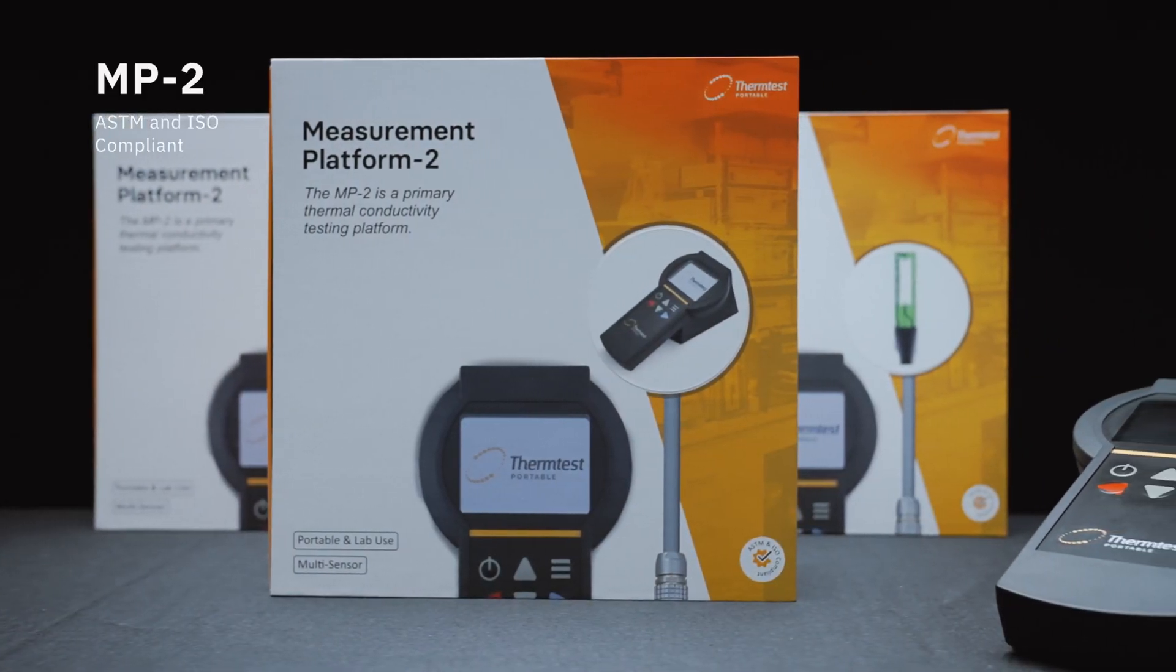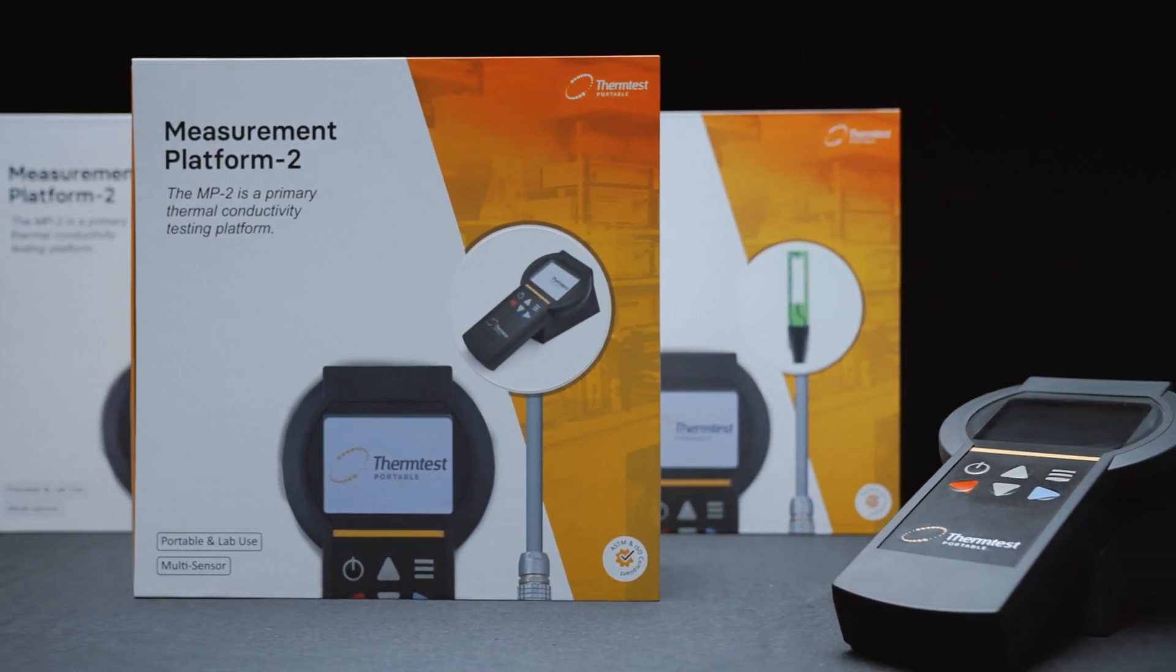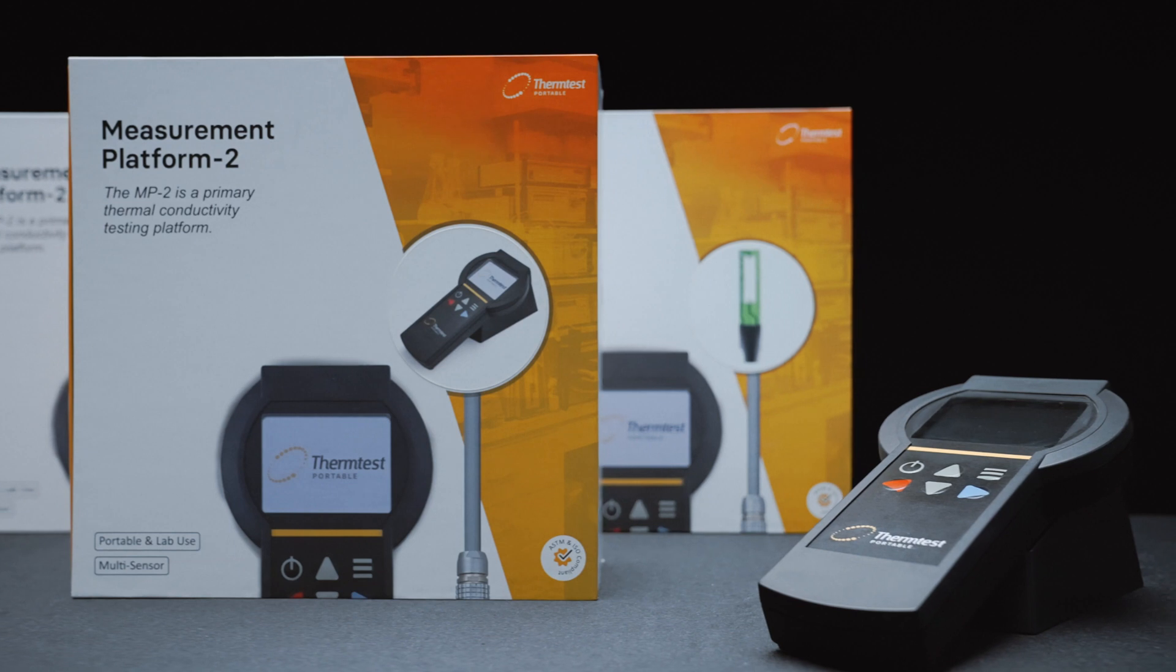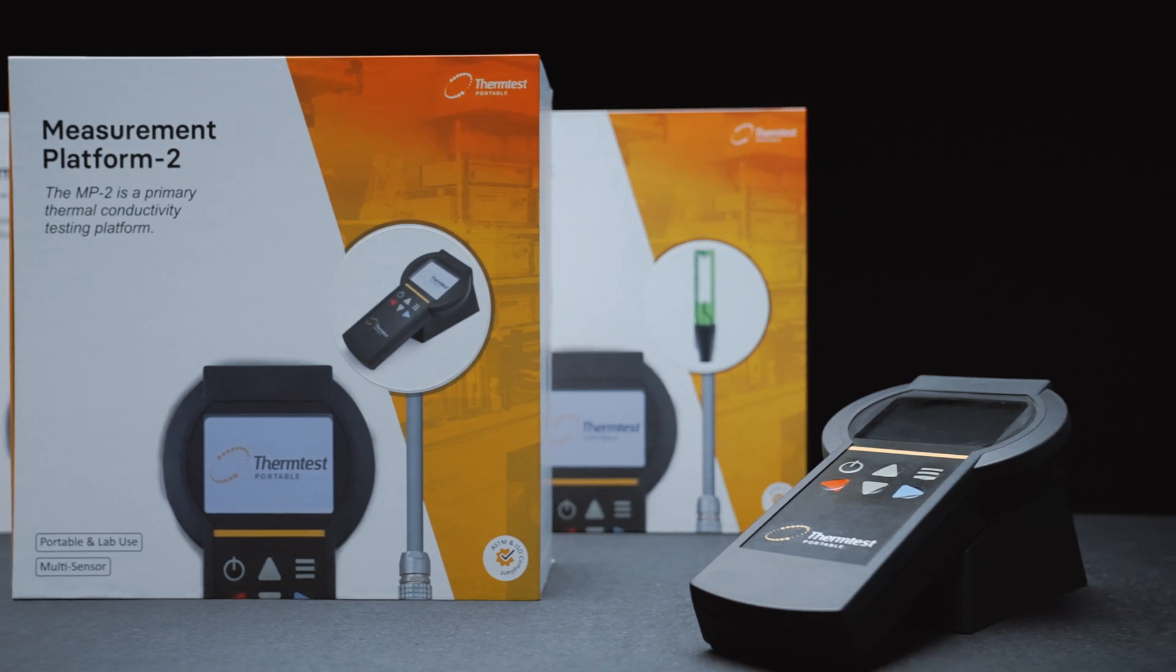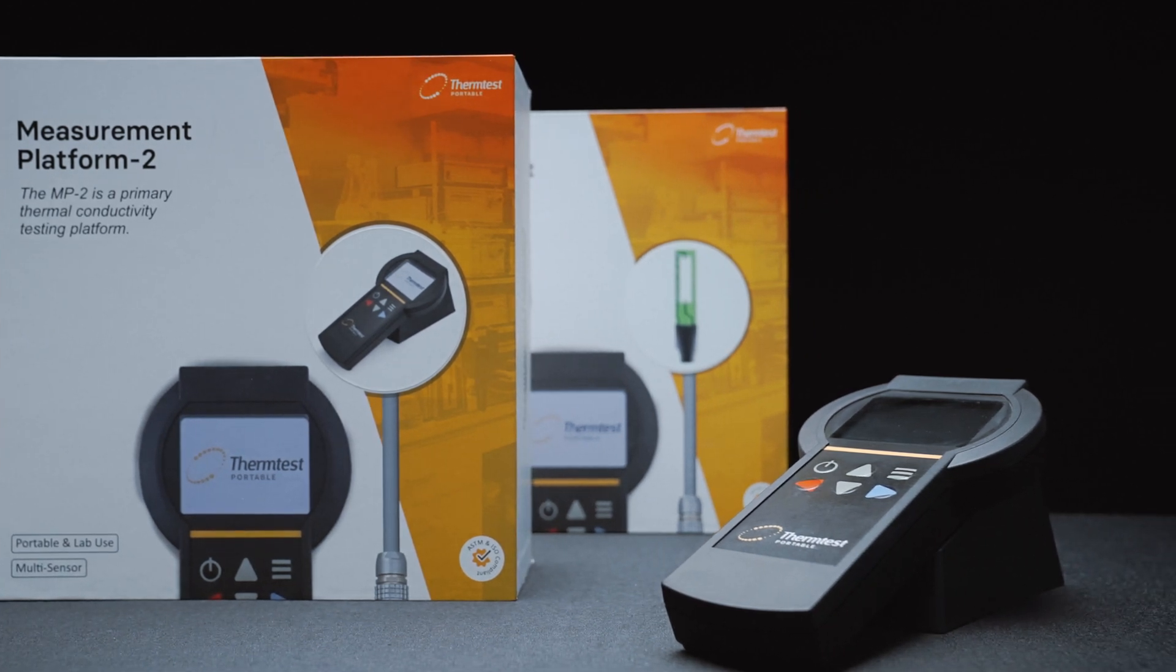Introducing the MP2 for thermal conductivity measurements of liquids, solids, pastes, and powders in accordance with ASTM and ISO standards.